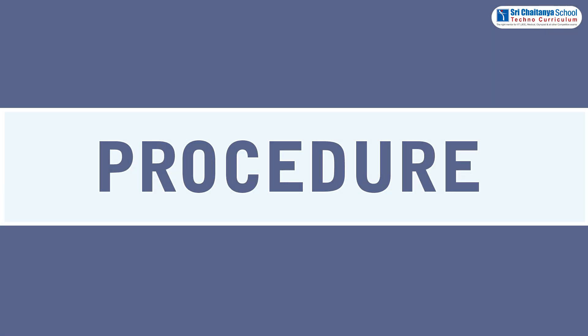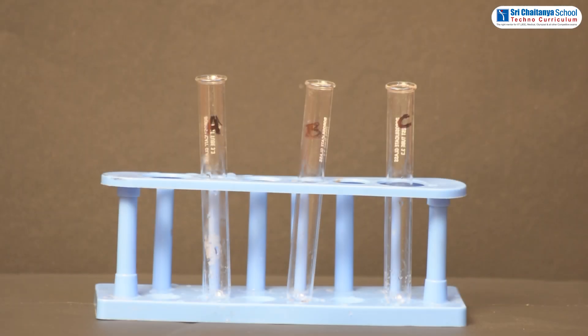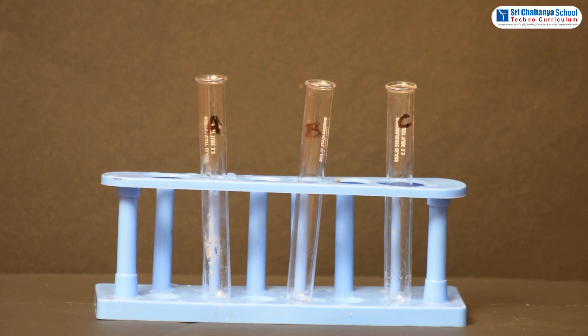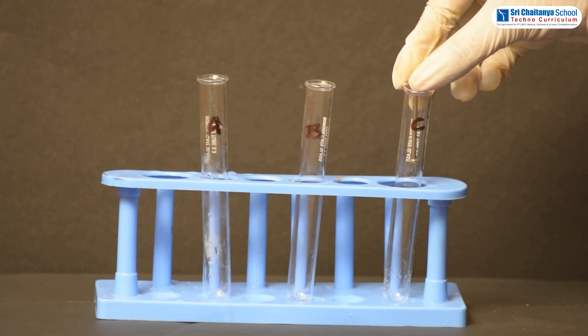Now it is time to see procedure. Take three test tubes and mark these tubes as A, B and C. Place iron nails in each of them.